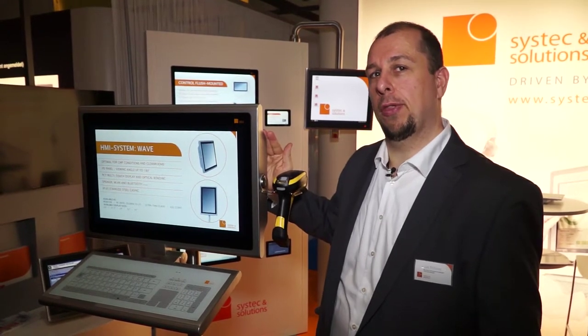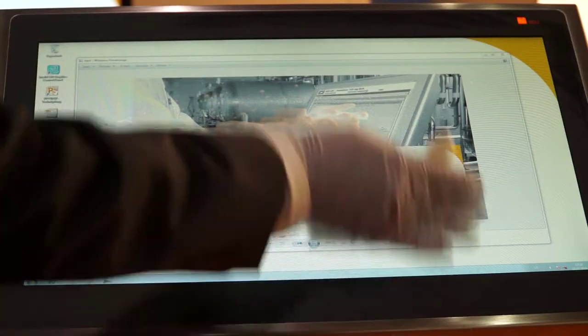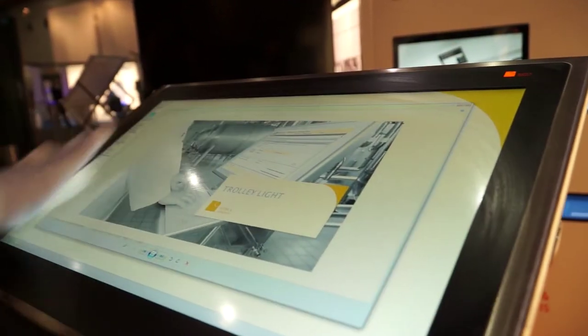The Wave is our best-in-class cleanroom HMI solution. It has a smooth stainless steel surface, is fully encapsulated and IP65 rated. It is easy to clean and withstands industry-specific cleaning agents such as isopropanol and hydrogen peroxide.